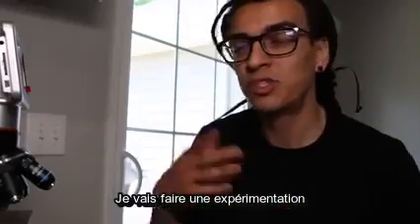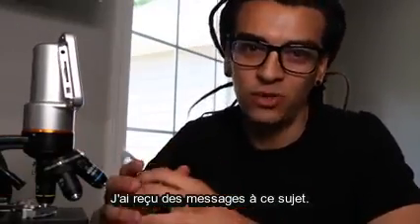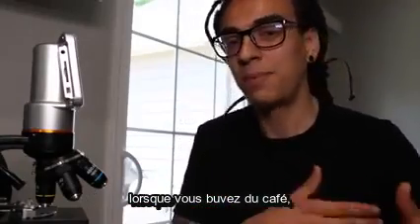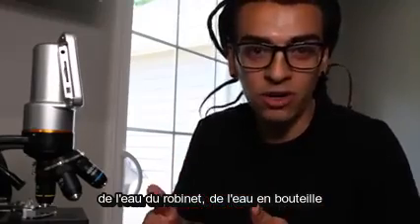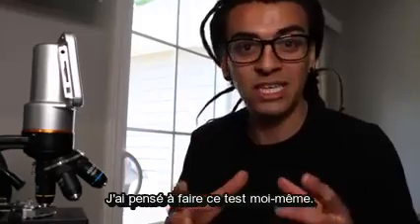So I'm gonna be doing another experiment with my microscope today, and a lot of people message me about this issue, and that is what happens to your blood cells when you drink coffee, what happens when you drink regular bottled water, and what happens when you drink Kangen water. So I thought I would do this test myself.